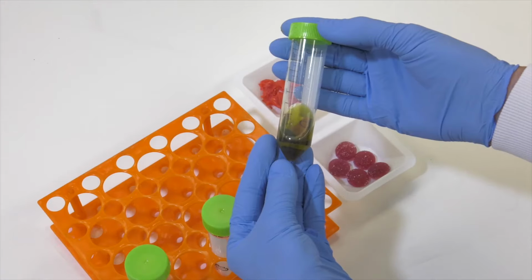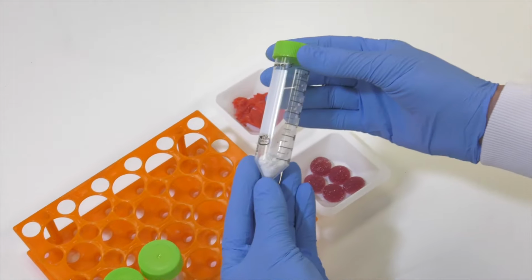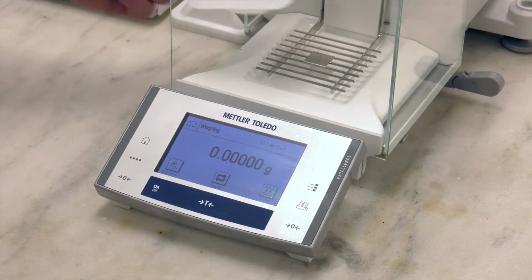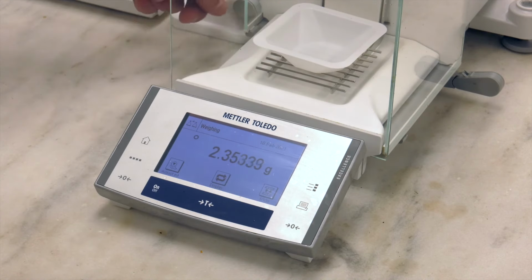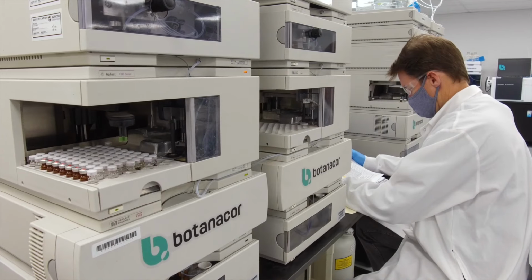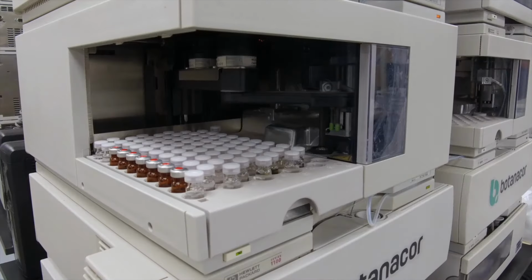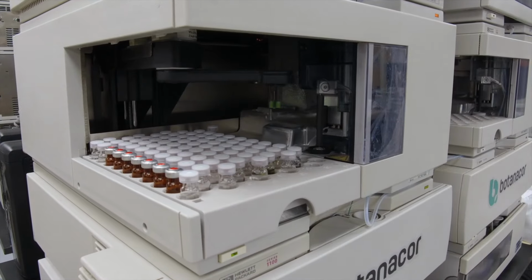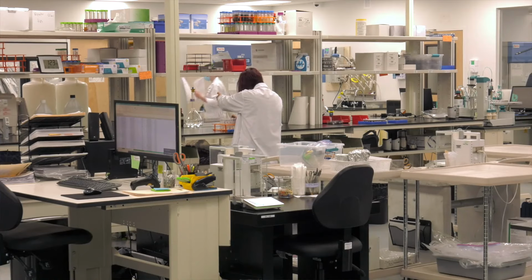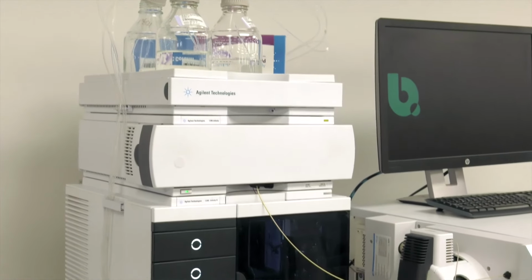So what is validation? It's really the execution of a series of tests to stress and challenge that process or that piece of equipment with all of its variables. We will run a whole series of tests to demonstrate that, say in HPLC, the flow rate is accurate, the gradient proportioning valve is accurate, the detector is accurate, the temperature in the thermostated column compartment is accurate. It's really running a whole suite of tests to demonstrate that it is doing what it is supposed to do.